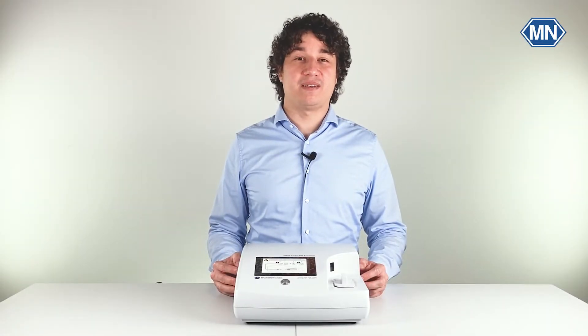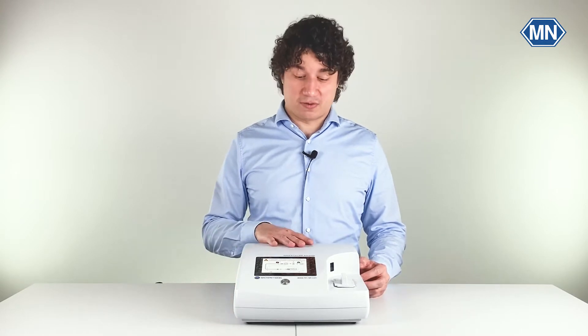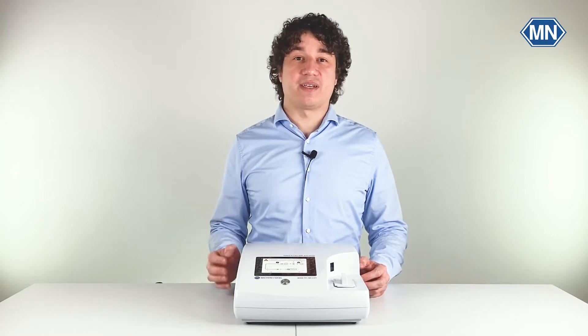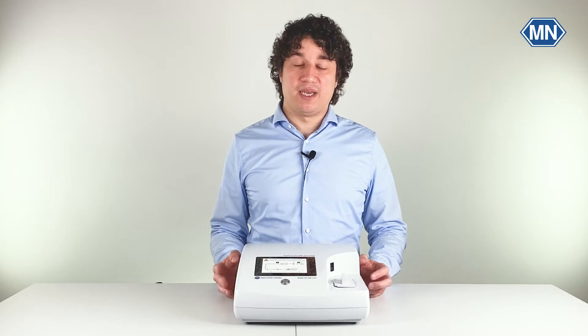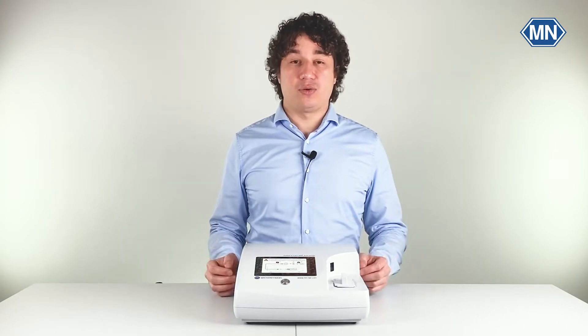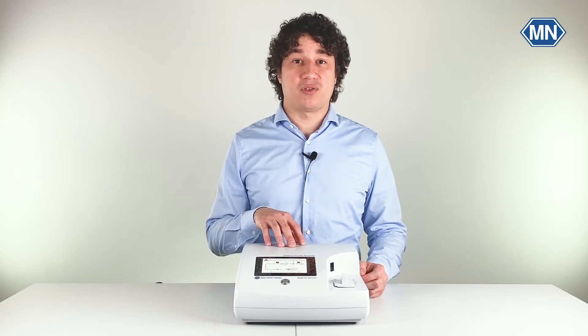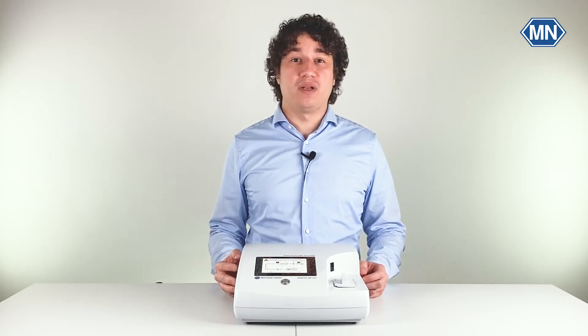Hello everyone, my name is Danny and I work here at Macherey-Nagel in Germany. In our last video I showed you the unboxing of the NanoColor Advance and all the accessories that you get within the package. In this video we will concentrate on the photometer itself. I will show you all the important steps from your first start-up to your first test result. So without further ado, let's head right into it.